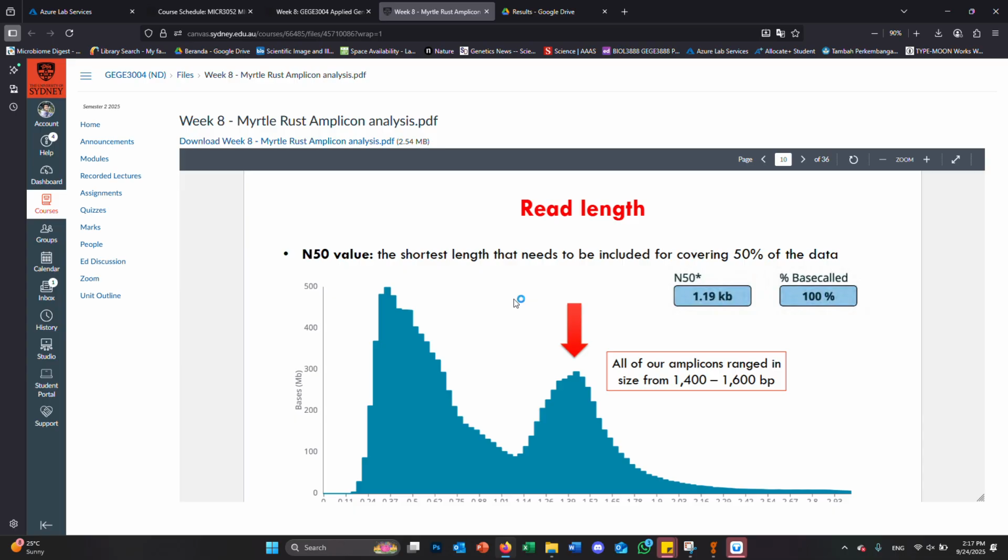I would, depending on the experiment I had planned. So if you've got 400 pores left, you could just use it to sequence a plasmid. If your lab does that kind of work, you can definitely get some more juice out of something like that, or even for some metagenomics. Cool. There you go. We're not going to reuse it. We just put it in the pile for next year's class to do some practice loading again. But yeah, you could potentially get some more data out of a flow cell like that.